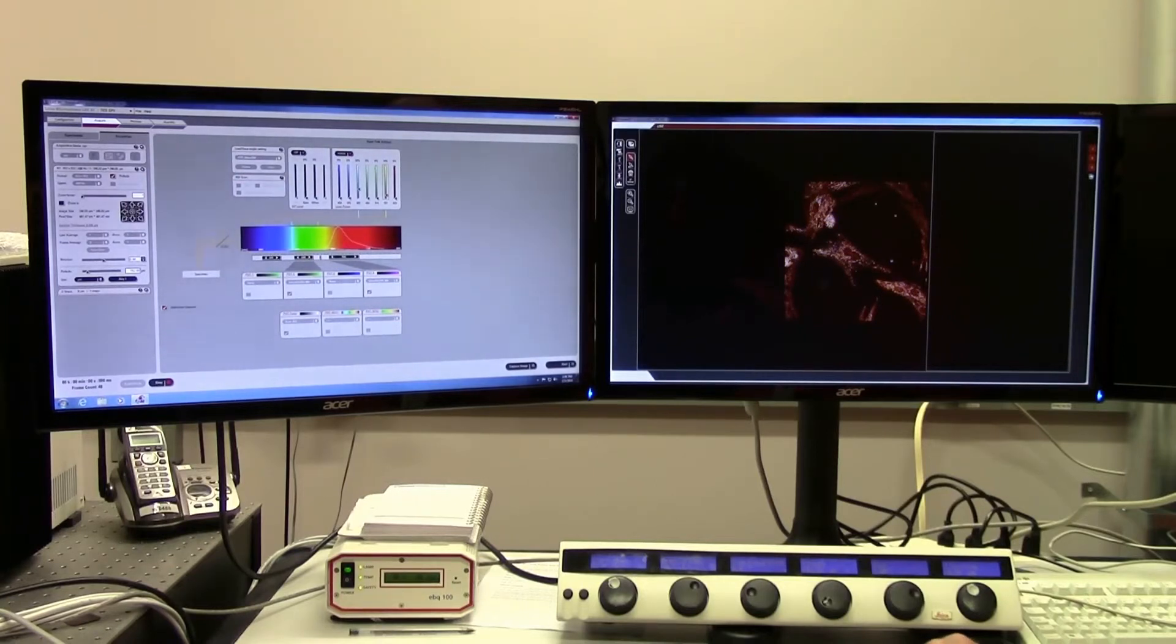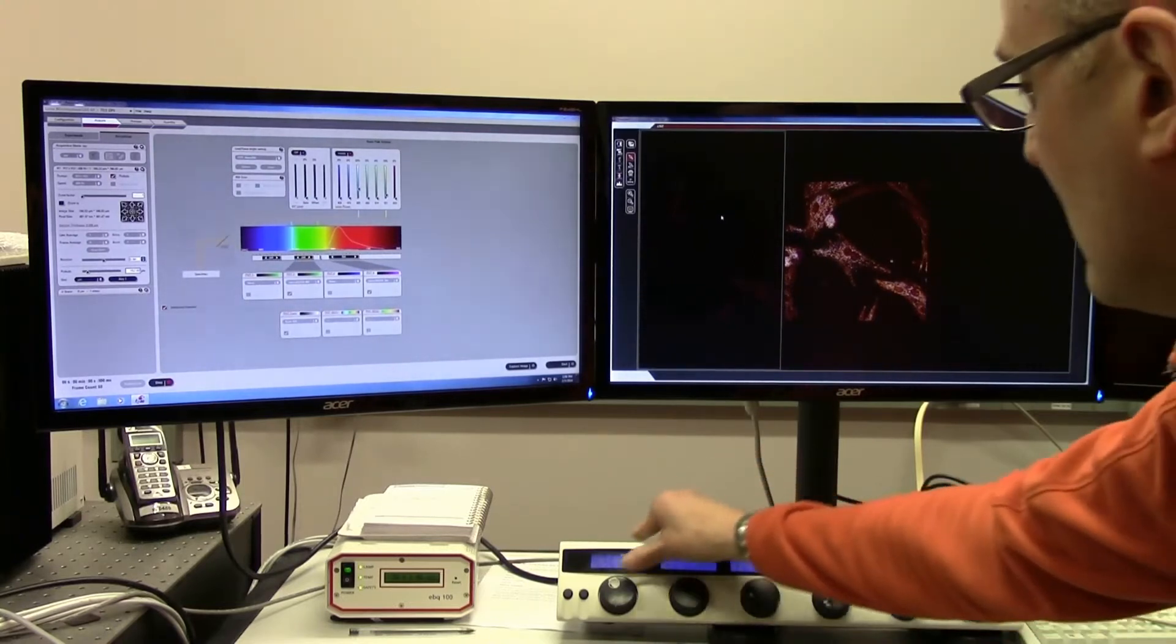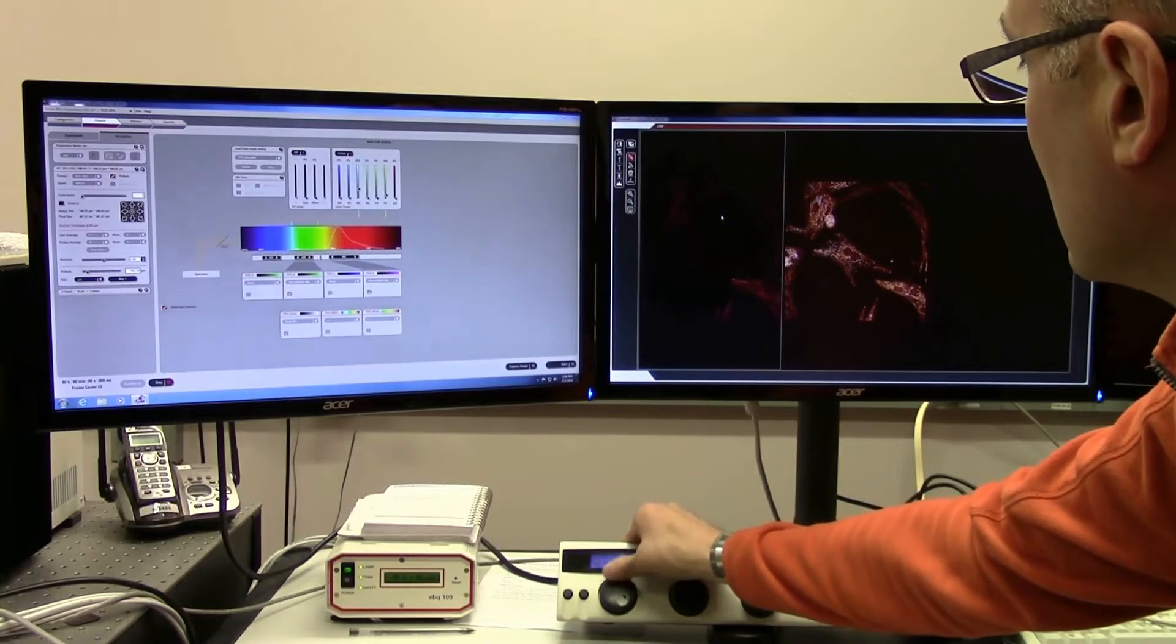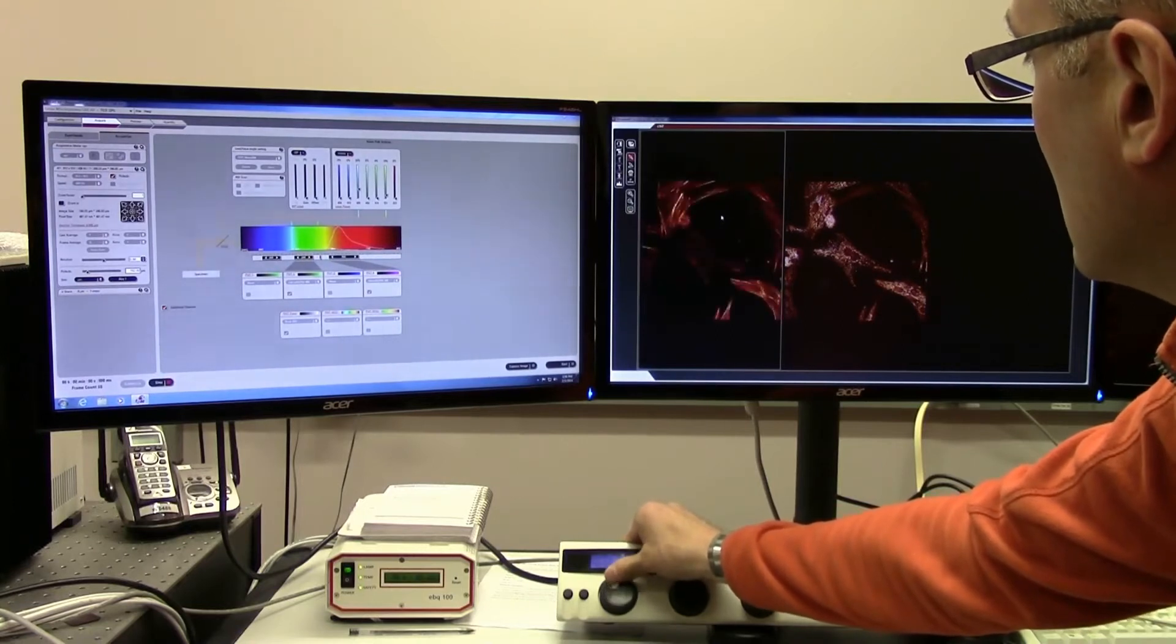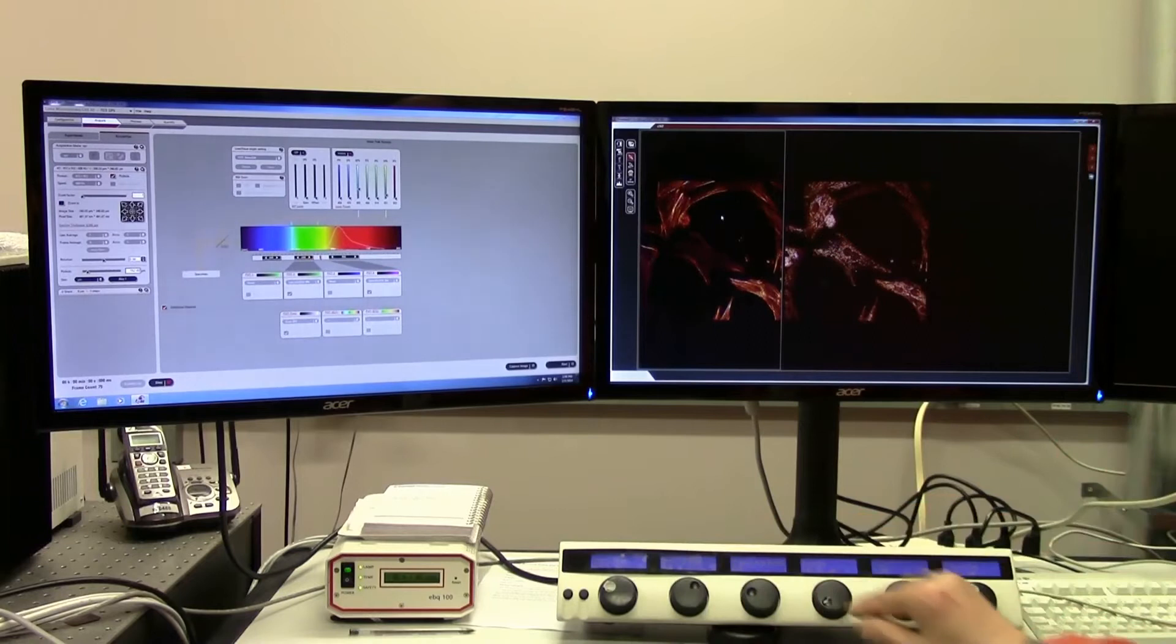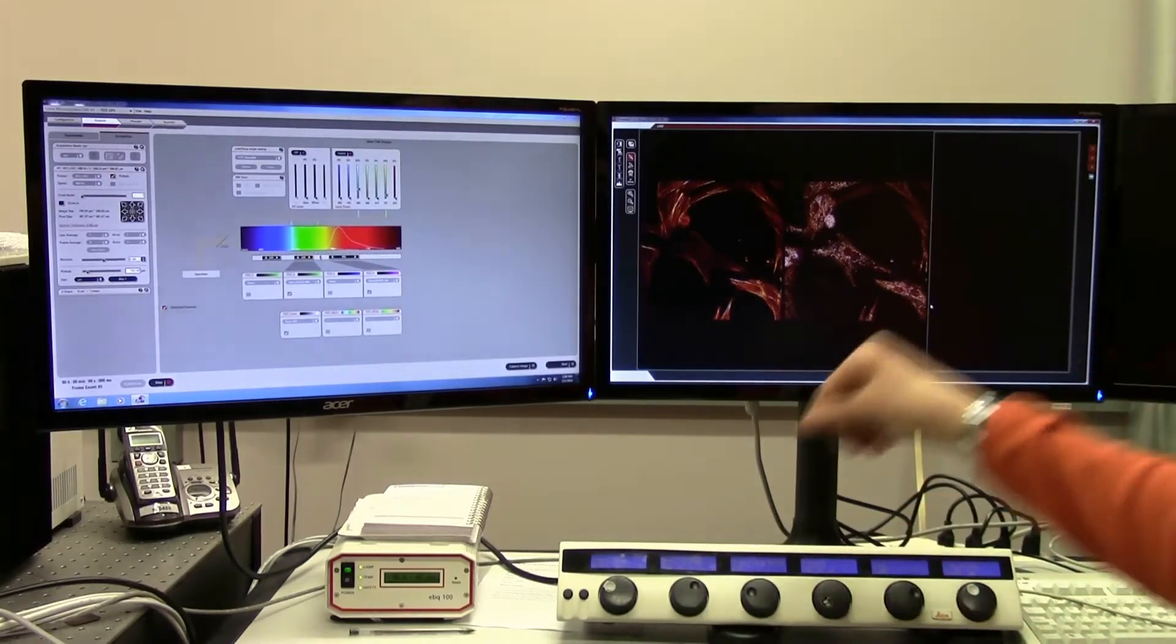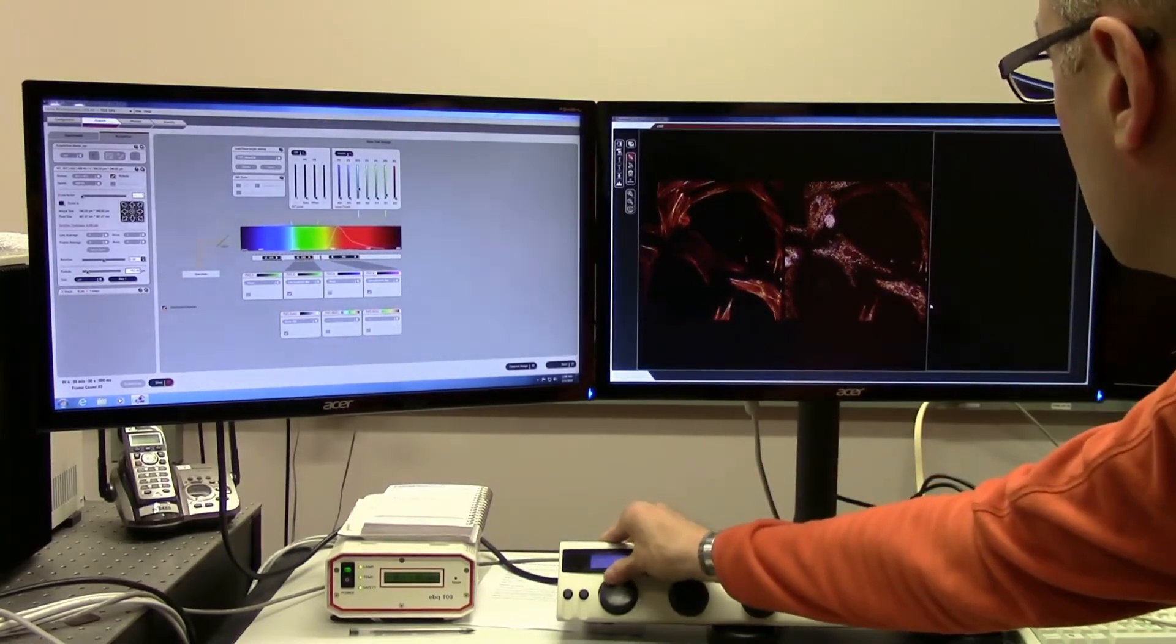That's in the linear range. I'm going to switch over to the green channel now and turn up that gain slightly, but again, keeping it within the dynamic range. Then I'm finally going to adjust the DIC channel and turn up the gain there.